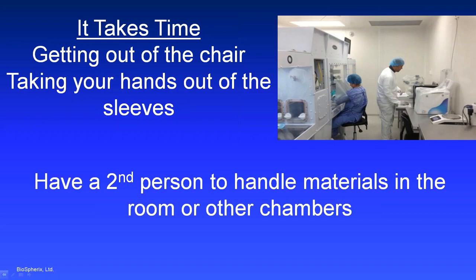Those of you that are coming from an academic world, I'm going to encourage you to have a second person in the room to handle all the materials in the room or in other chambers in the Xvivo, so that person sitting at the processing chamber doesn't have to get up and go do everything. This will save you a lot of time.